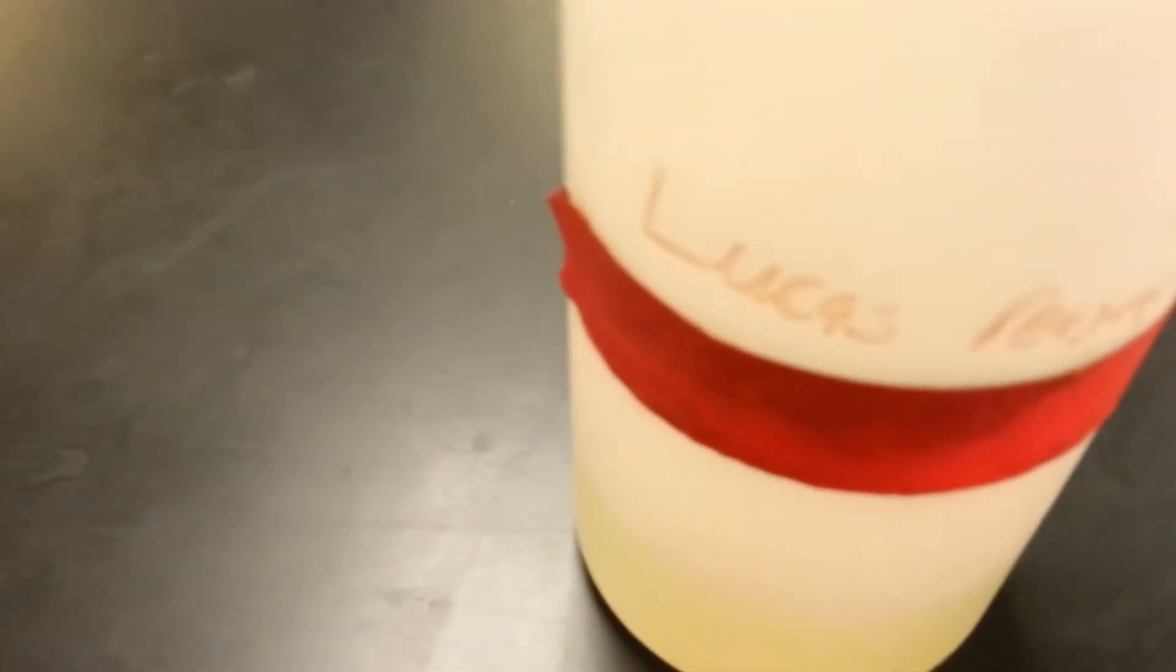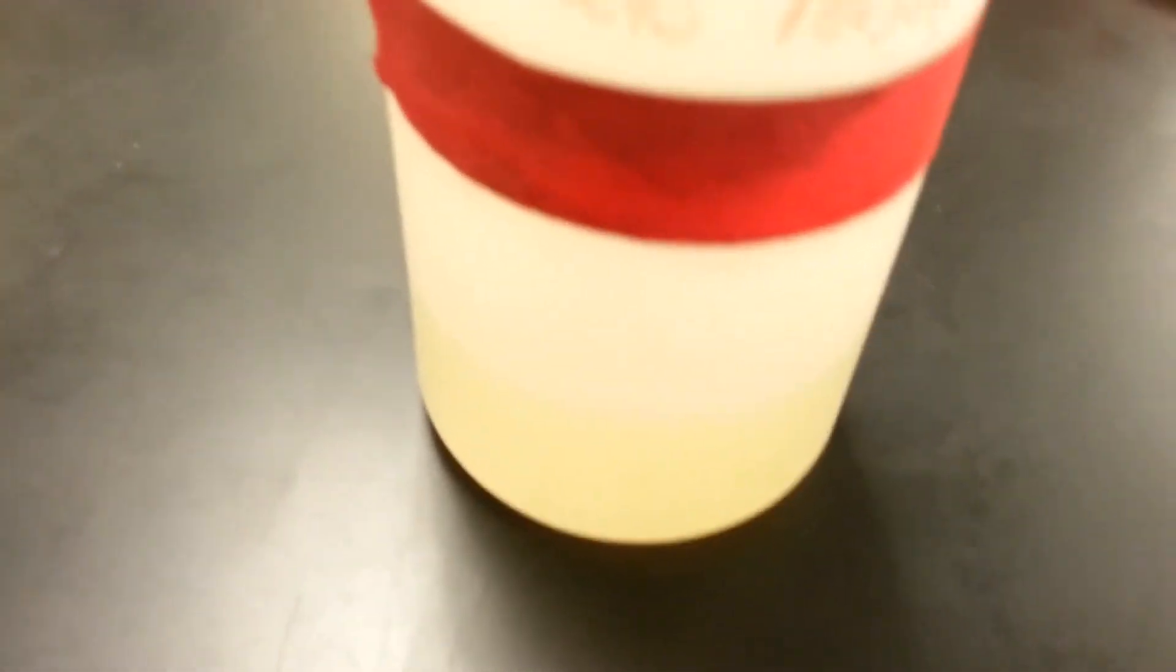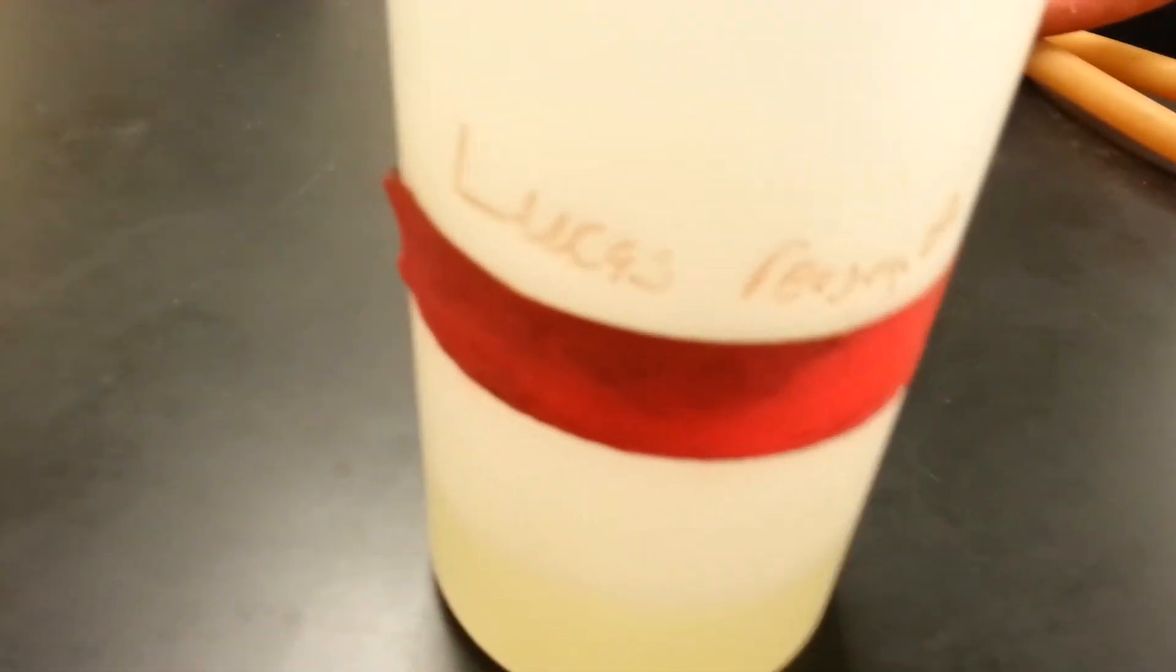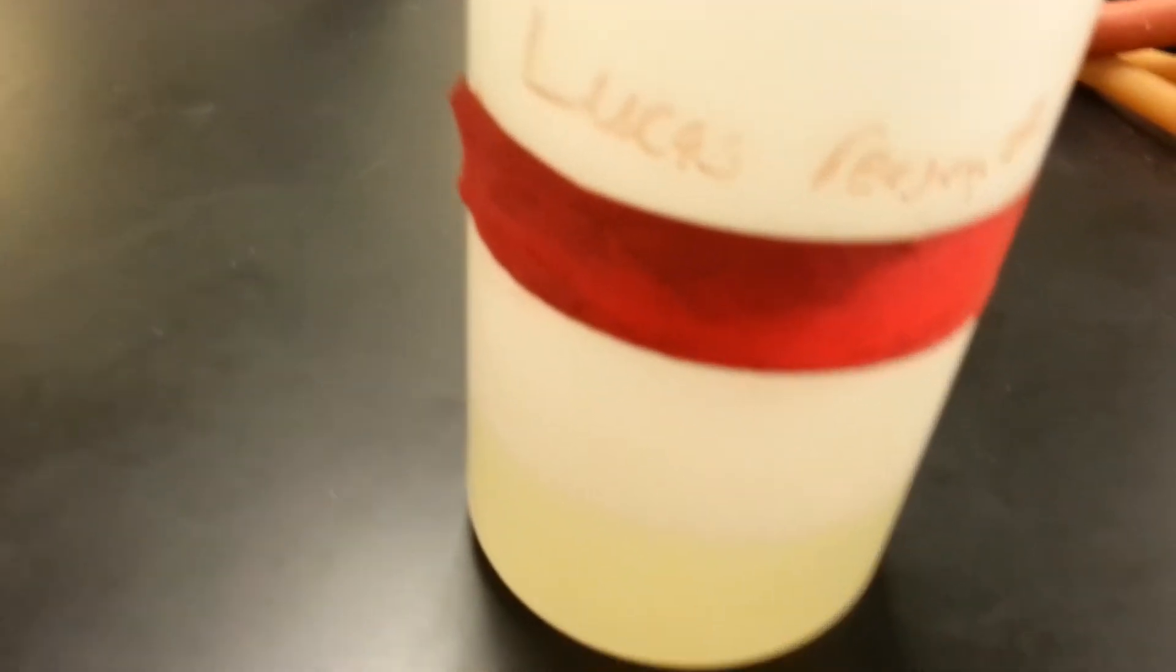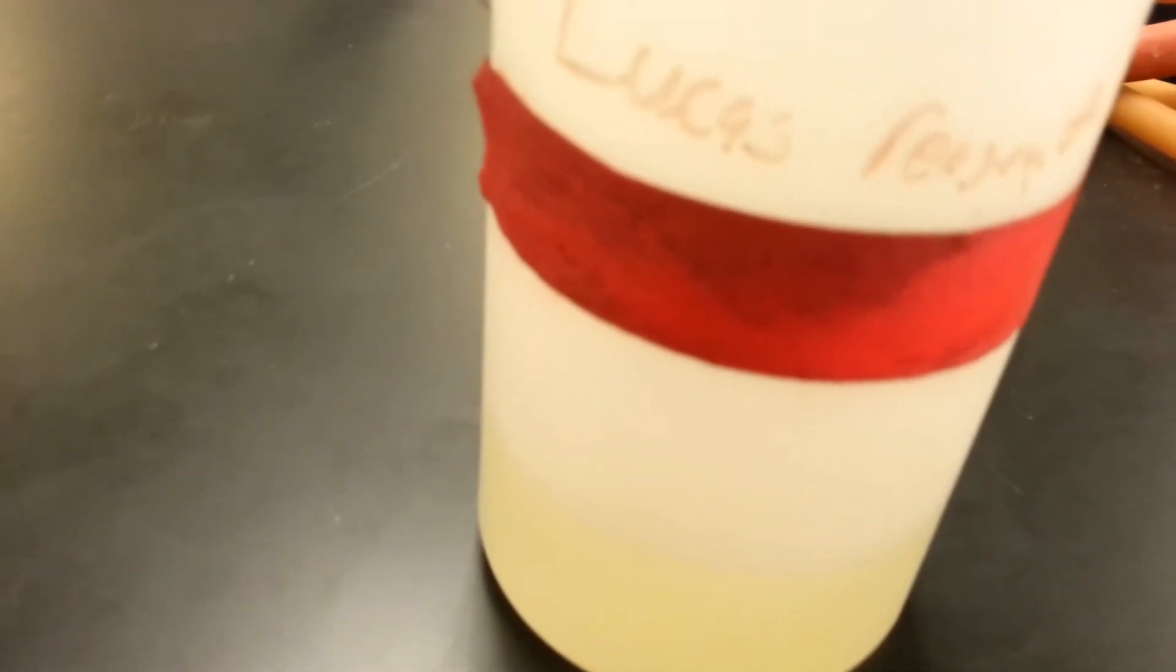Just so you know, Lucas Reagent, I personally have just added zinc to hydrochloric acid, and it seems to work. But you should add the zinc chloride if that's what the instructions say. And the zinc chloride has to be anhydrous, because zinc chloride does seem to like to absorb water from the air. So you might want to make it anhydrous, if you can.